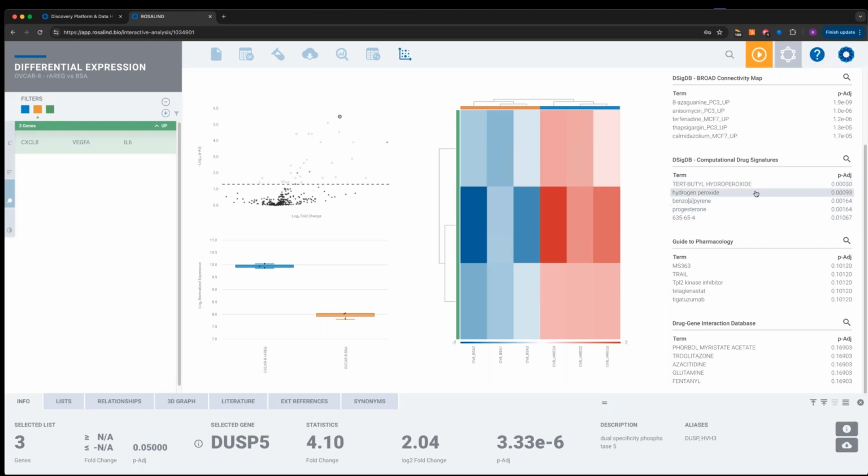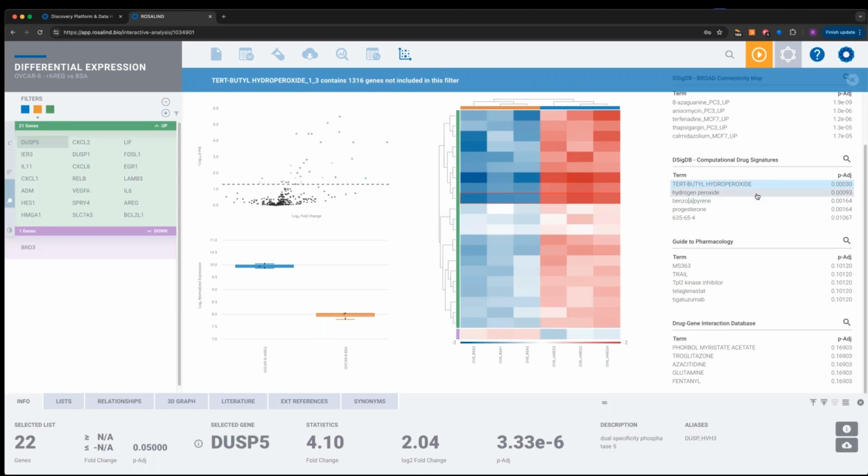So these compounds have a significant enrichment relative to my novel drug that I'm testing here. Can I infer that my novel drug, my novel compound, has a similar mechanism of action to these compounds here? Maybe they do, maybe they don't. These are ways to try to guide you to uncover the mechanism of action of your drug.